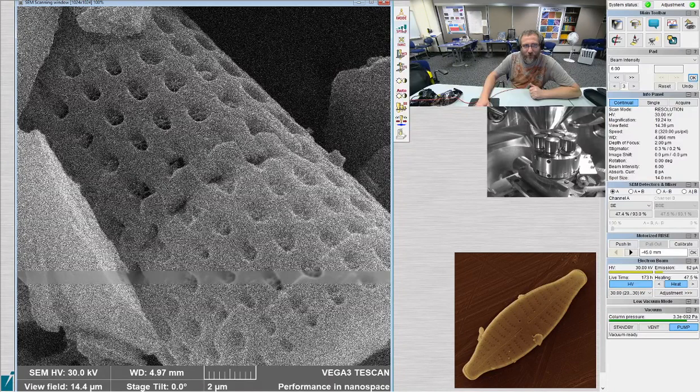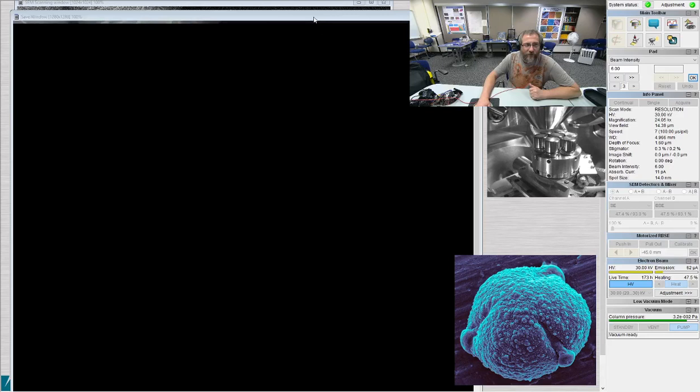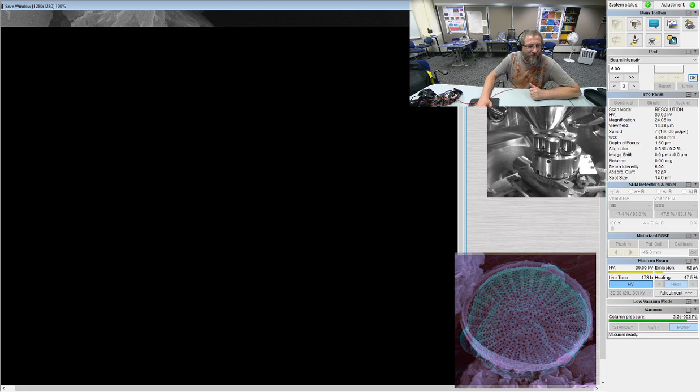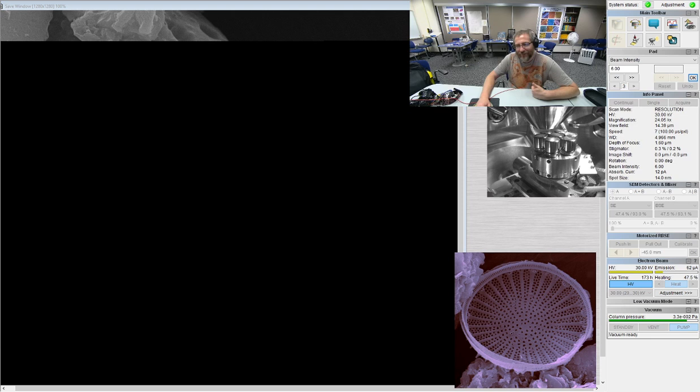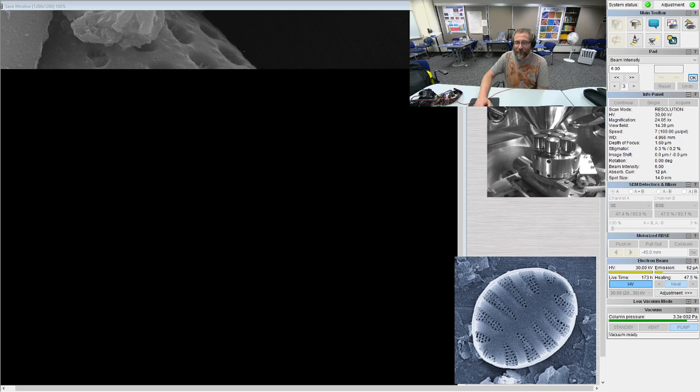Yeah, that's all right. I think the spines and a couple cribra being in focus would make a really nice shot for this one. It's the artsy, doing an artsy shot. You know, for the coffee table books. I've never seen a diatom coffee table book. Do those show up at meetings sometimes? No, but I always threaten to make one. I probably should.